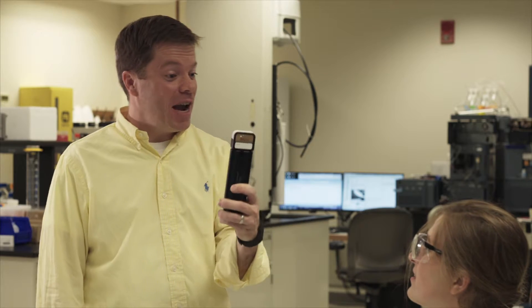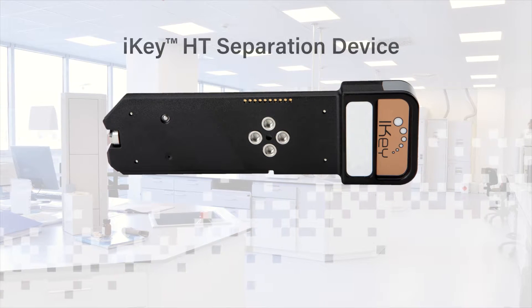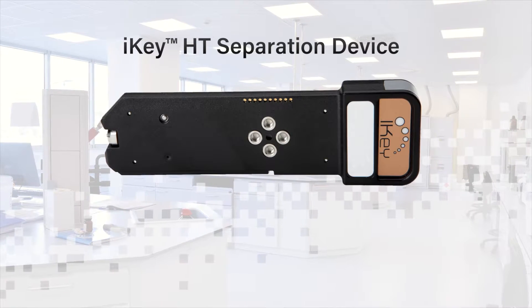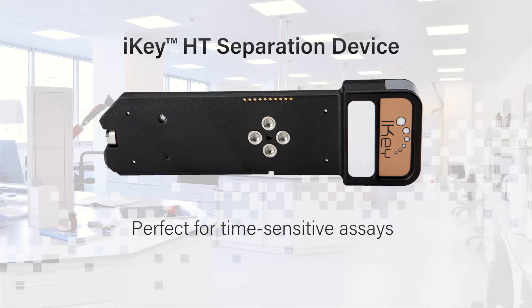Hey, what are you still doing here? I needed to finish running these samples, but I needed the enhanced sensitivity of Microflow. Why don't you try the iKey HT? The iKey HT — it's the latest and greatest in high-throughput technology. All the benefits of Microflow without losing any time. It's perfect for those time-sensitive assays that you need to get done.